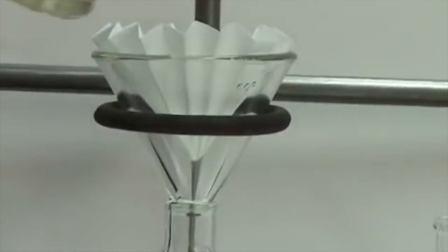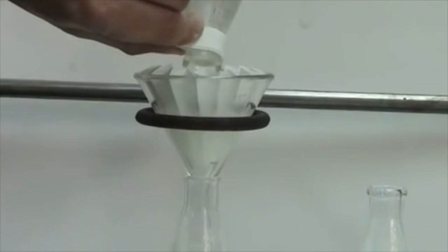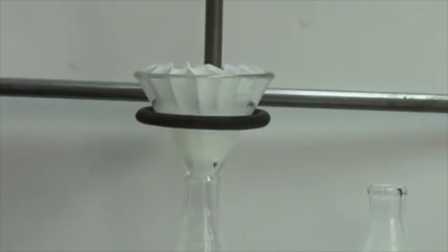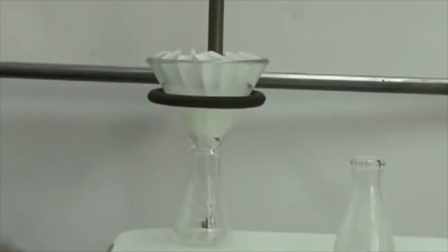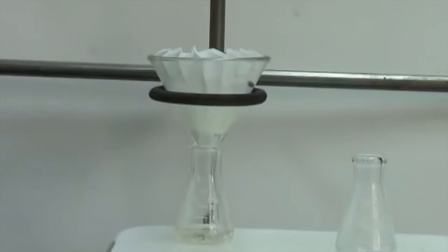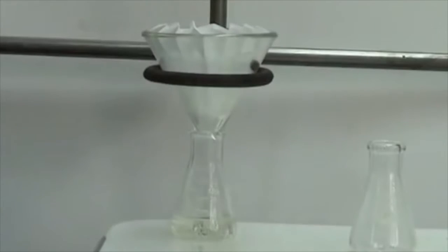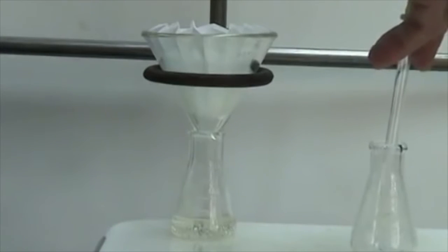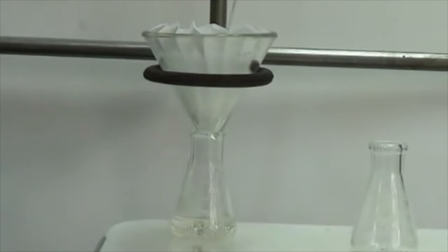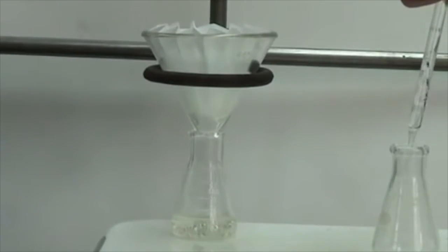Next, we filter out the insoluble impurities through the filter paper into the warm flask on the hot plate. After most of the solution is strained through the filter paper, use a couple small portions of the hot recrystallizing solvent to rinse the paper.